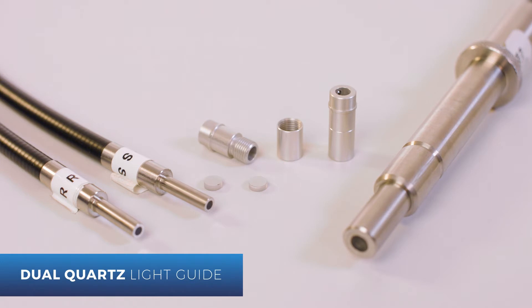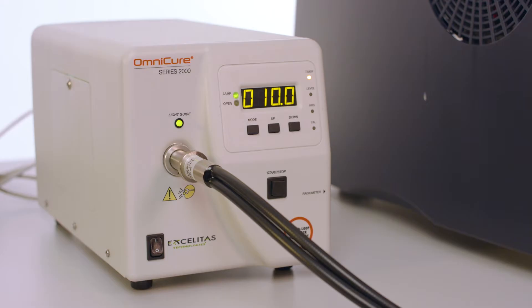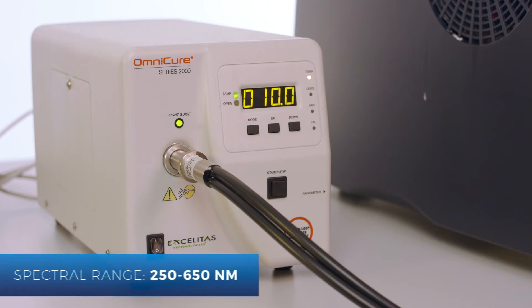The light guide is attached to the instrument using a special adapter. The light source Omnicure, which contains a high-pressure mercury lamp, delivers light over wavelengths ranging from 250 to 650 nanometers.